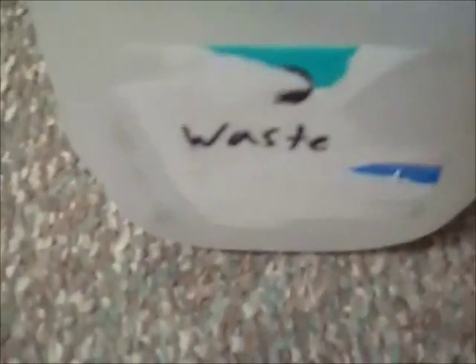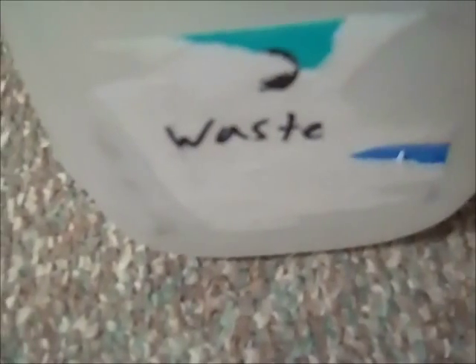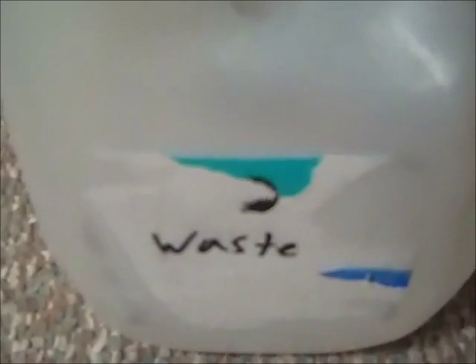Worth mentioning are my containers being used as waste. This is a Hawaiian Punch bottle that was destined for the recycler, so I just picked it up and I'm using it to contain the waste from my experiments. It's relatively inert plastic, so it should be safe for that. After it fills, I leave it outside and then begin transferring waste to this — a Publix bottle that previously contained water. But that distilled water has been used in all of my experiments, so it now is a waste container.